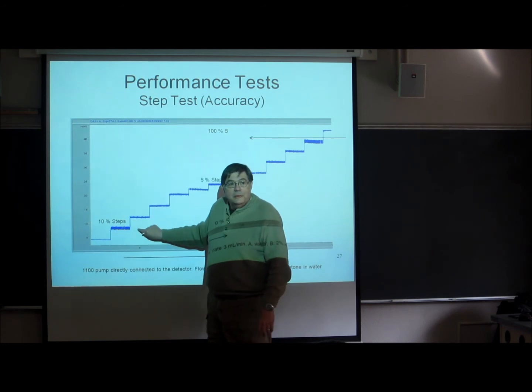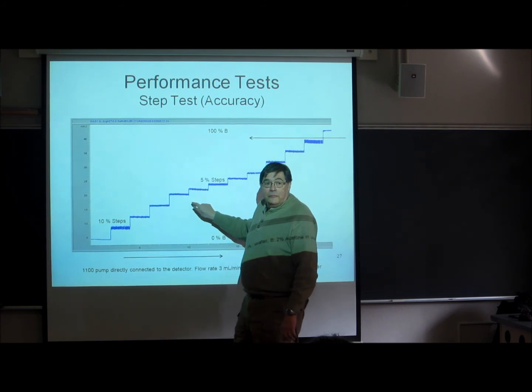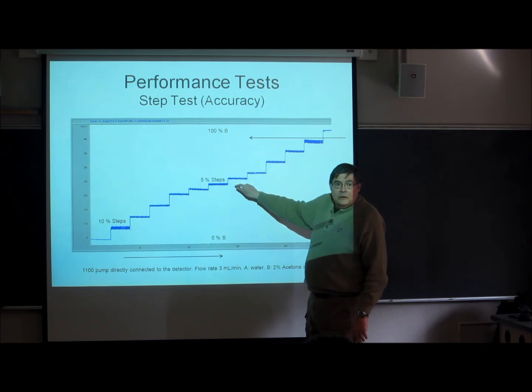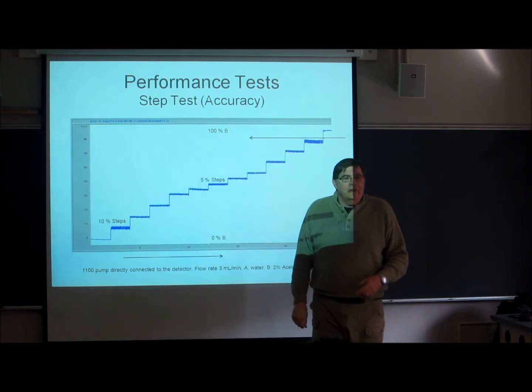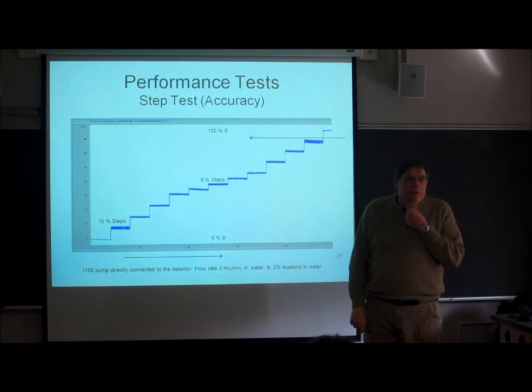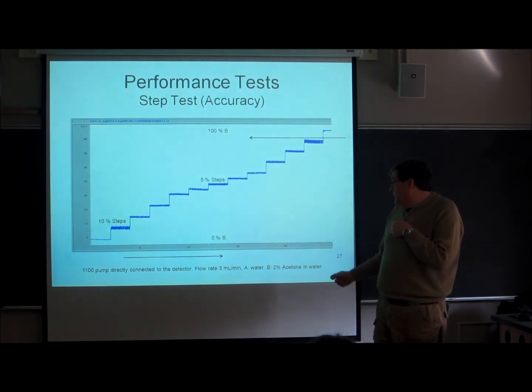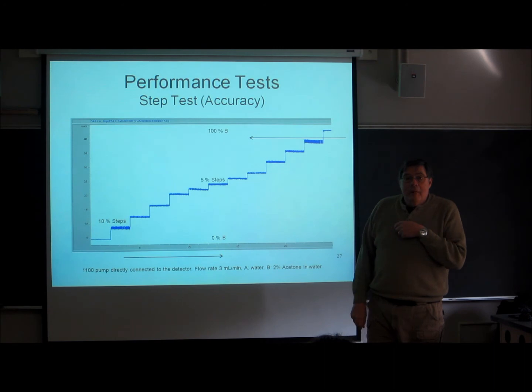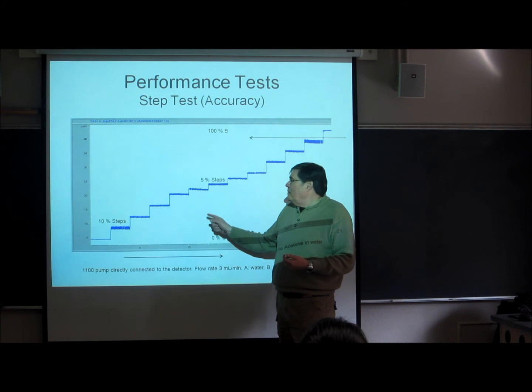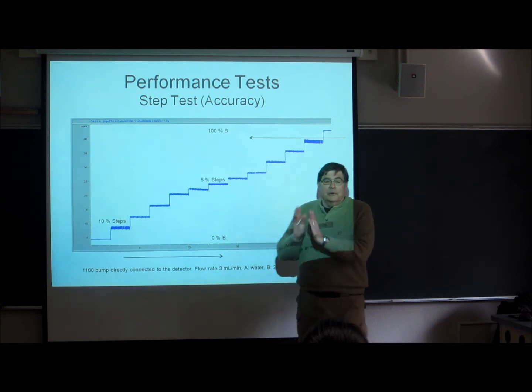What do you suppose you want? You want nice sharp steps, and you also want flat steps. Okay. See, are these perfectly flat? What do you think that might suggest? What would you look for? Anything? I mean, maybe they're supposed to be perfectly flat. Maybe it was, but it came from Agilent, I believe. It looks like it might be a leaky seal on one of these pumps, maybe. I don't know, but that's where I would start looking for trouble. Ideally, these would be perfectly flat and perfectly straight.